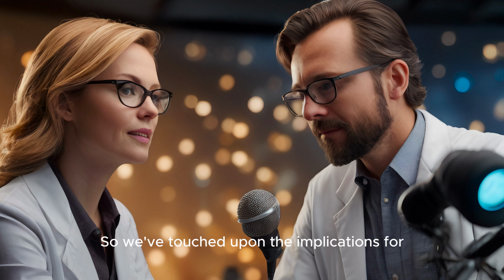So we've touched upon the implications for drug development, microplastics analysis, and materials science. But let's unpack those a bit further. Okay, starting with drug development, the thalidomide example really hit home. Yeah. Being able to isolate specific enantiomers could prevent similar tragedies from happening in the future.